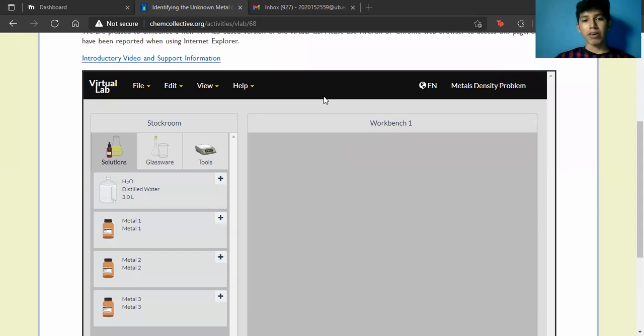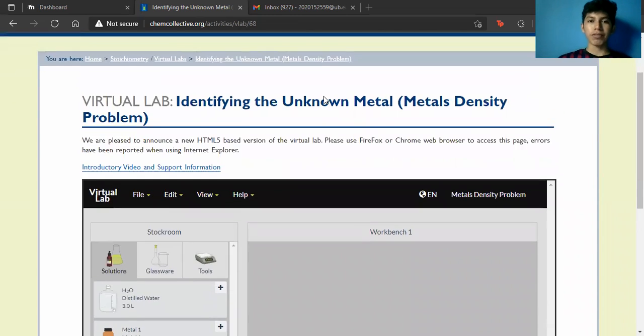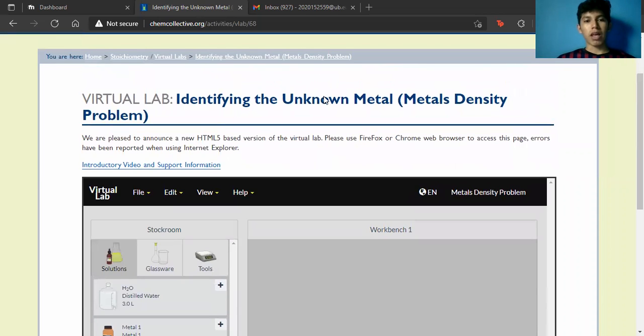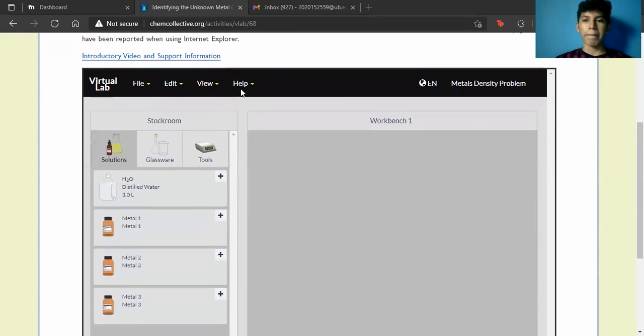My name is Edgar Cruz. I'm part of the 8 a.m. class for Chemistry Lab 1. This is my recording for lab number 3, which is the metal density problem lab.